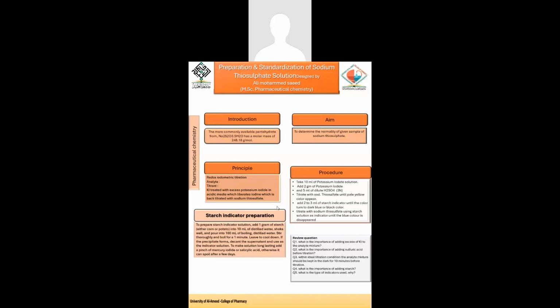حاليا صار عندي pale yellow color، لكن بقى عندي الأيودين. طبعا أحتاج أن أضيف المعادلة أيضا. على مود يكون الكلام بوضوح، المعادلة عندي KIO3 زائد KI بوجود الأسيد ميديا، يتكون لي الأيودين، ثلاثة أيودين 3I2 and water.